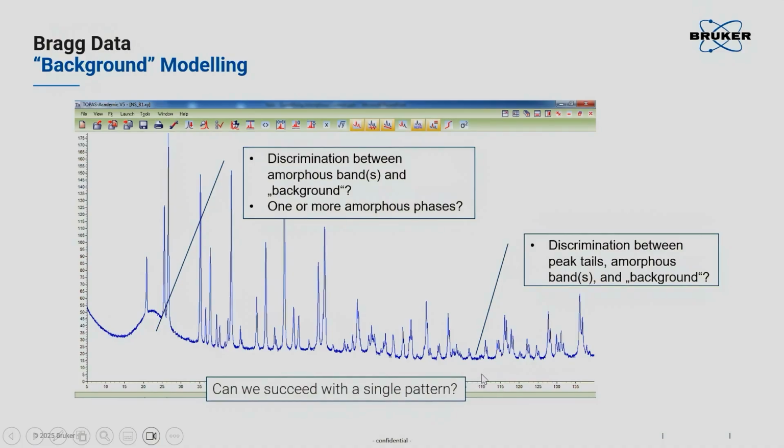So ideally the difference between my measured powder pattern and the instrument function represents the amorphous phase, with of course all allowance for error, dependent on how well I can distinguish between the peak intensities and the amorphous phase. And if I have two amorphous phases, it's only getting more difficult. But it can be done, not in all cases, but in a significant number of cases.